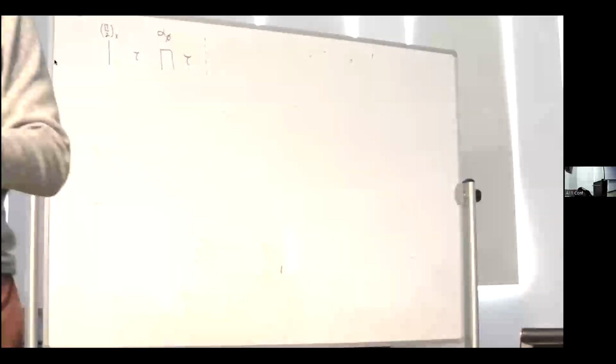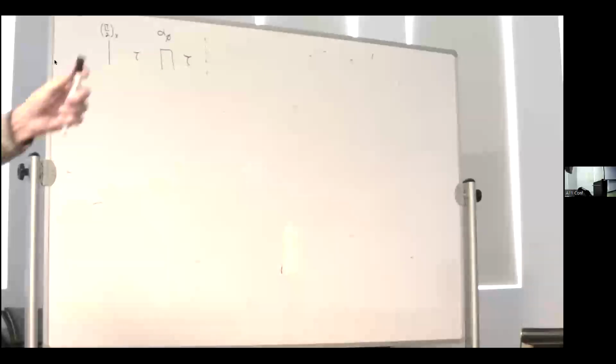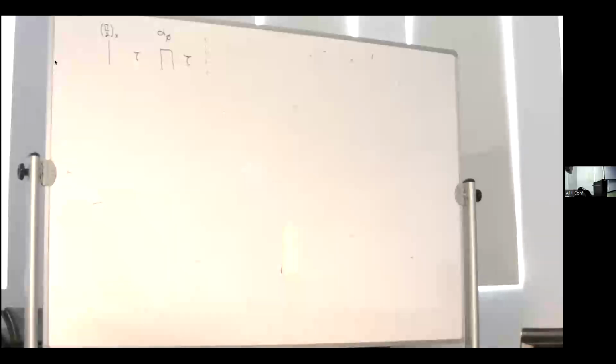So exorcycle changes the phase of phi in 90-degree steps. So you're going to do 4 experiments in which phi is x, y, minus x, minus y, and then try to figure out how you should add or subtract those 4 signals in order to get as clean a spectrum as possible. Exorcycle meant something extraordinary long ago.